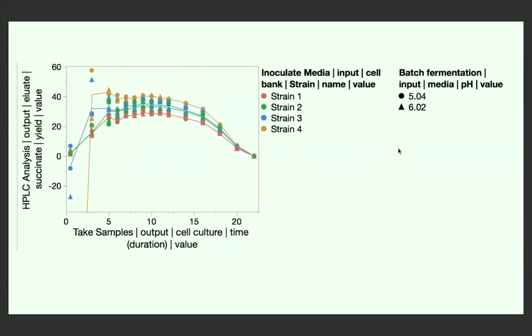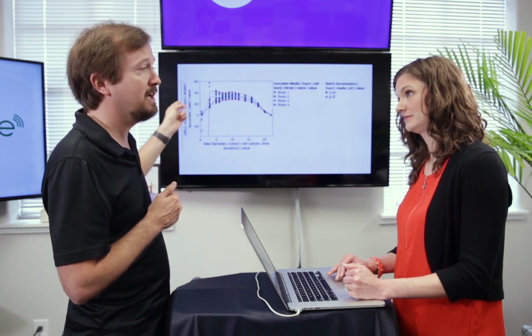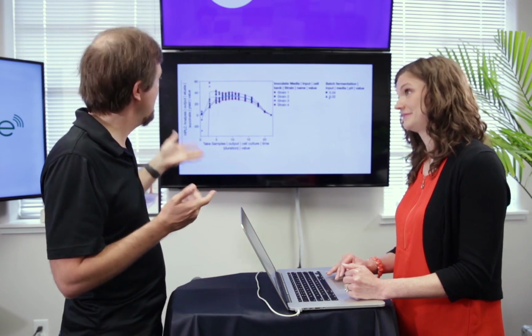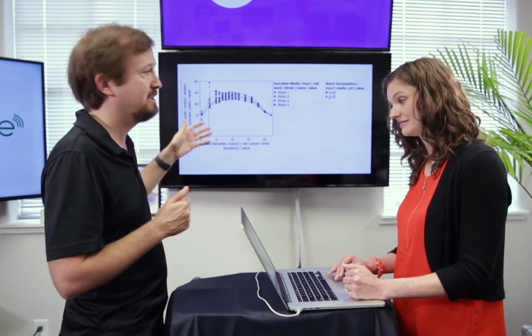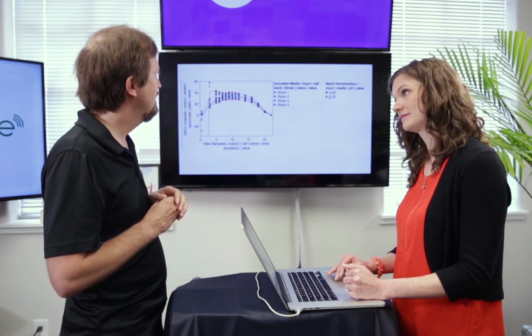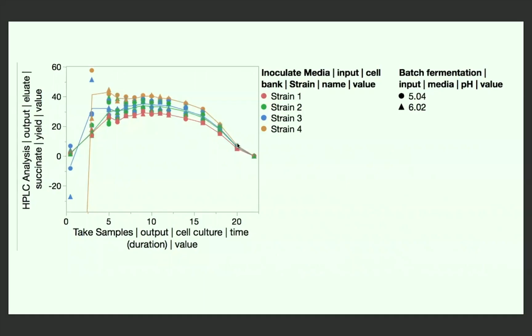So your goal, if you so choose to accept it, is to find out which of these strains performs better under which condition. And this is what I did in graduate school. I kind of put my finger into the air and I pick one and think that maybe it's a little bit more than the other, and I choose that, or I choose a parameter to then optimize or something else to go after. That's the old way of doing things. Yep, that's right. This is typical of how many of our customers are analyzing their data today. So they just plot it, and then they colored by strain, and they said, okay, I varied strain and I varied pH, and I want to understand the contribution of those two.